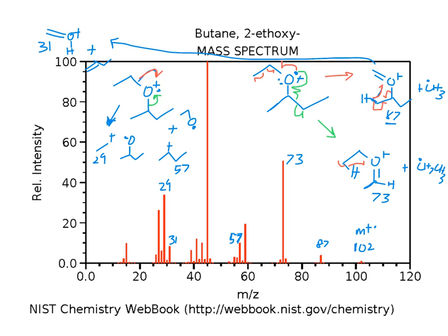I just had to come up with a way to understand the base peak. Okay, then we transferred the H over here. We get this plus the alkene.